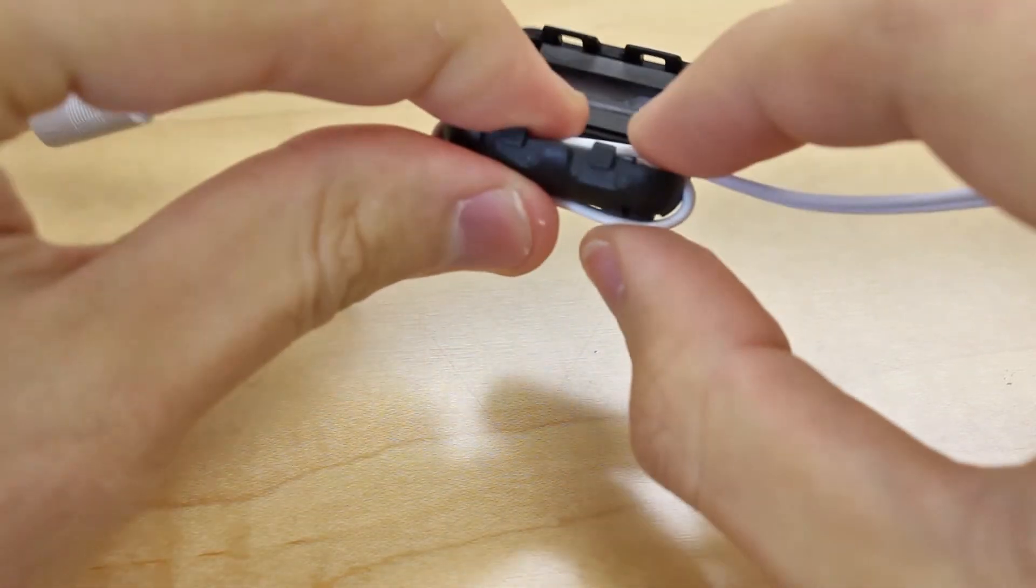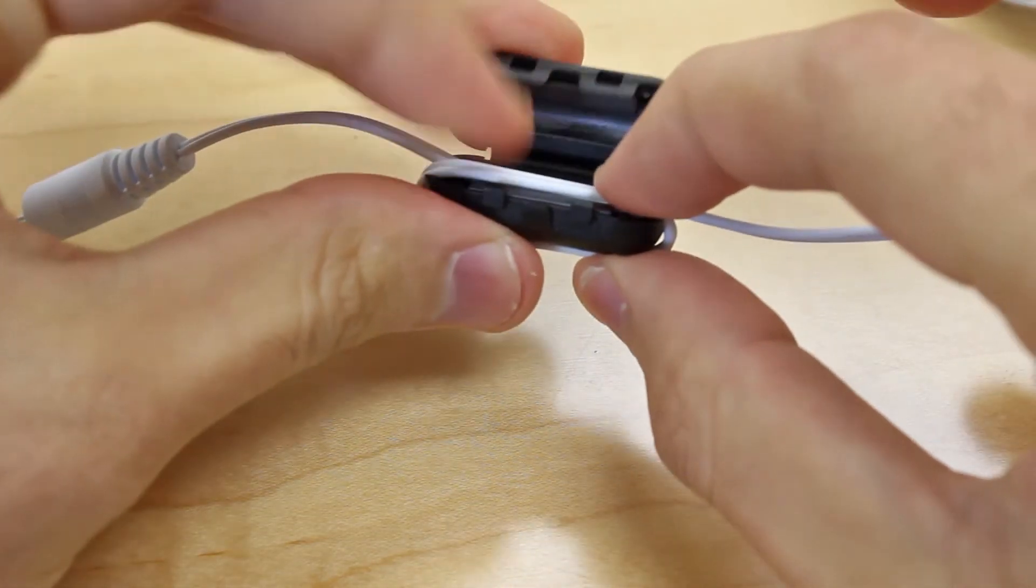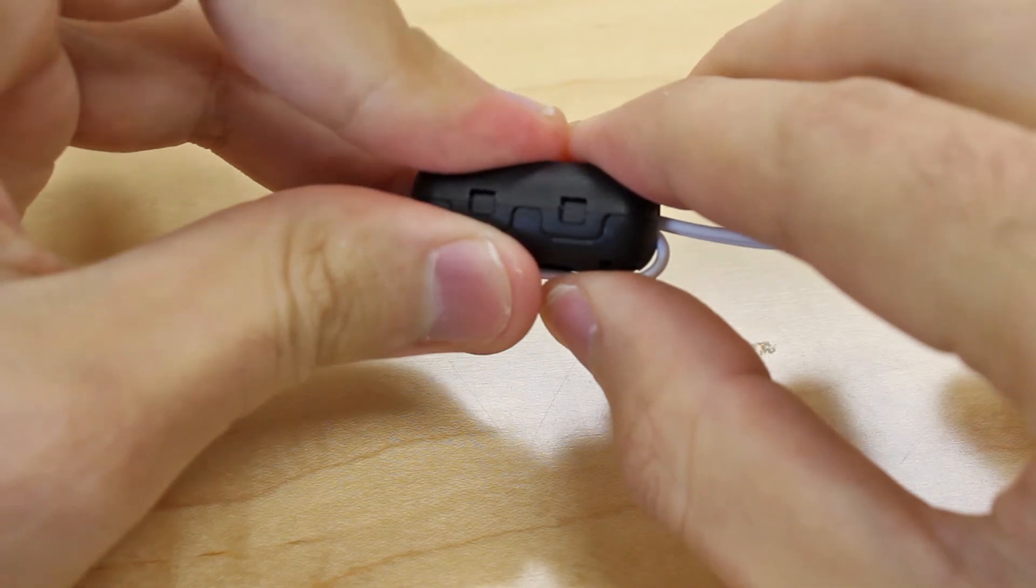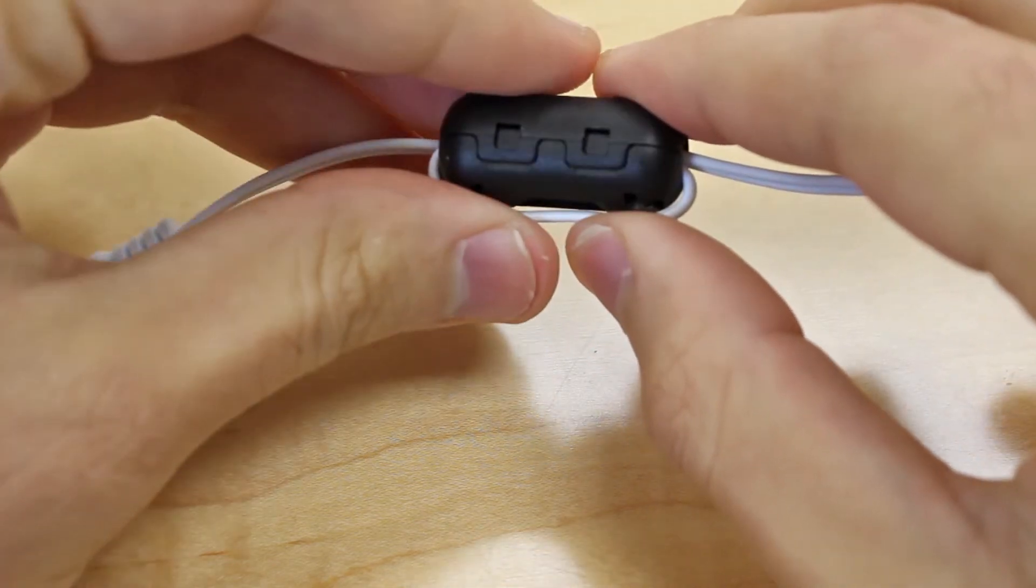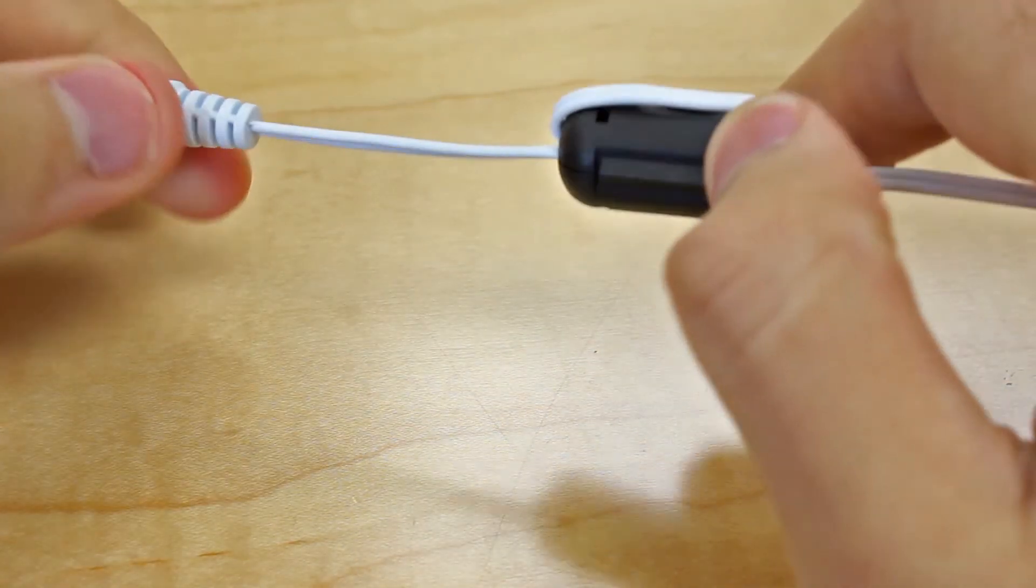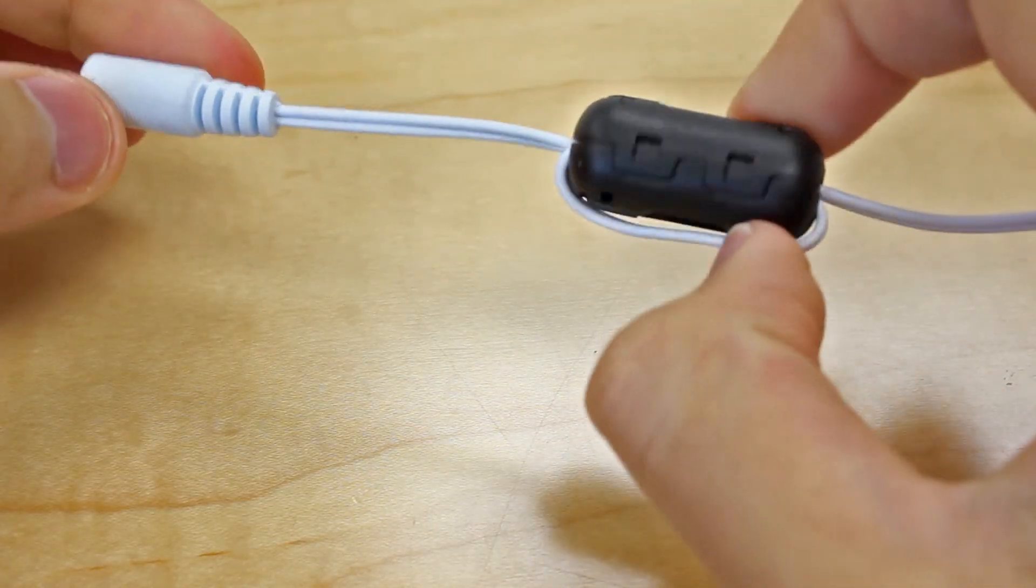Next, press and close the static suppressor firmly until you hear a click. This click ensures that the static suppressor is properly closed and installed correctly.